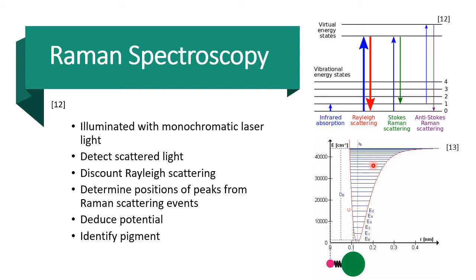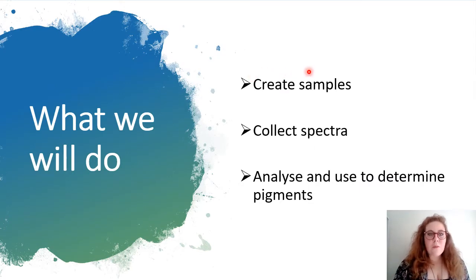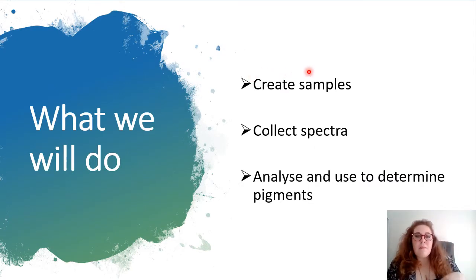These both have the same desired effect of increasing the number of incident photons, so increasing the number of scattering events, but shining high-intensity laser light in a concentrated area for a prolonged period of time can lead to localized heating, which can be destructive for artifacts. So, this is what the plan is for the majority of our project in 3 main steps.